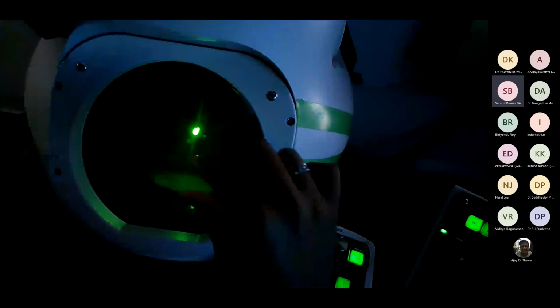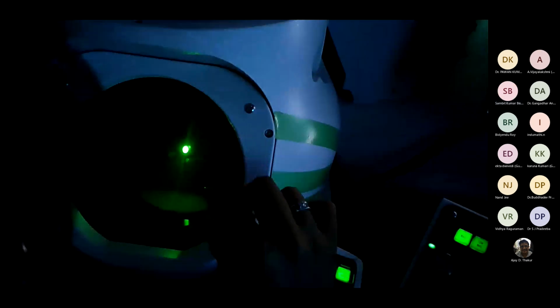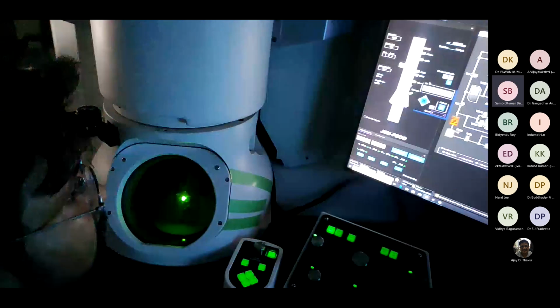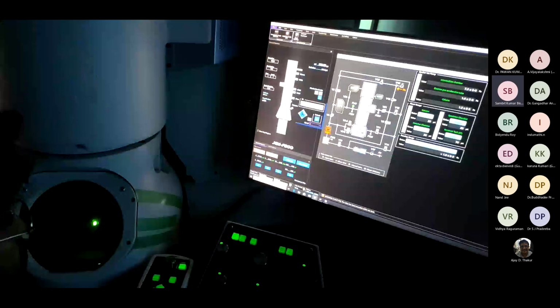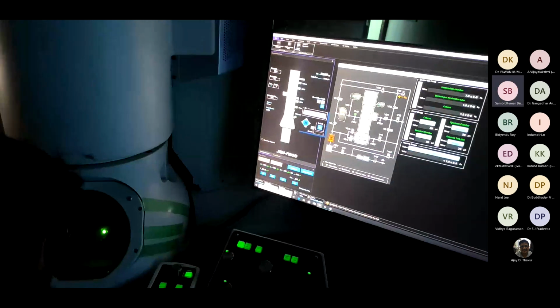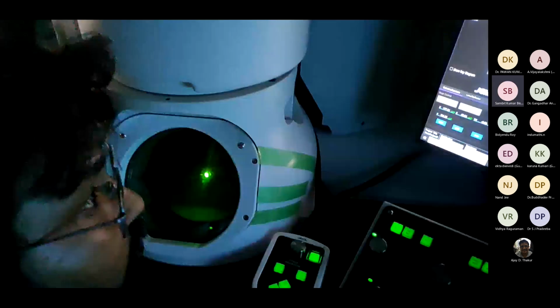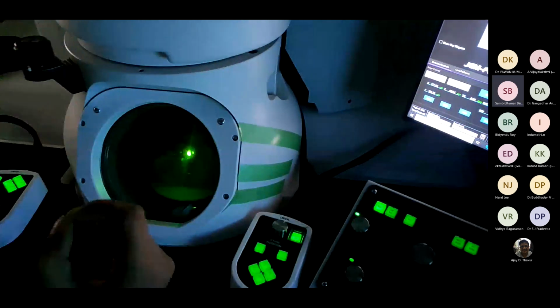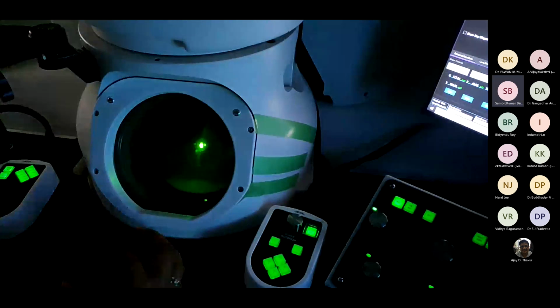A very small size, around 1 inch, something like a circular fluorescent screen. So make it center, moving the aperture to keep the beam aligned with the aperture. I mean, I'm centering the beam around the aperture.